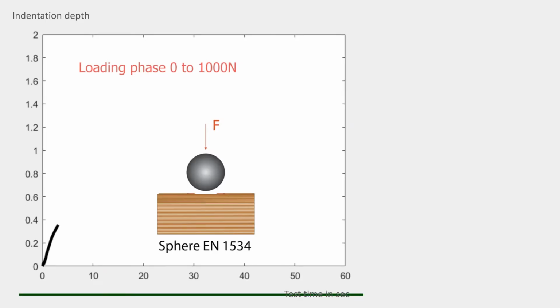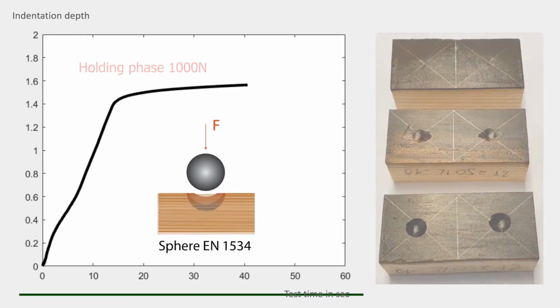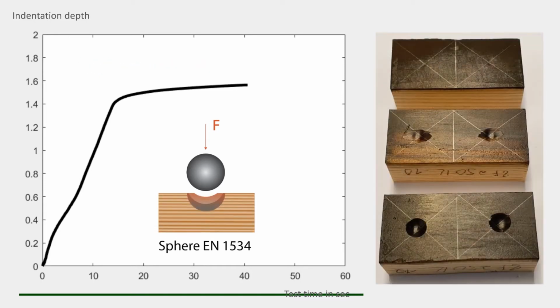In most research, hardness is the parameter used to answer this question. Here, a spherical indenter is forced into the wood and the material's resistance to the indentation is used to determine hardness. Since it's a ball-shaped indenter, the indentations can be very different and also different kinds of failure can occur.